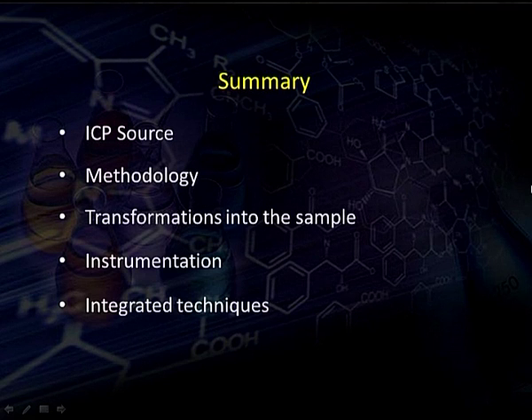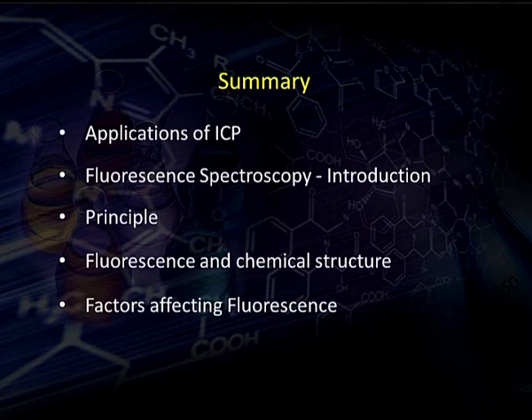Coming on to the summary. Today we have studied the remaining part of the inductively coupled plasma, which included the ICP source, methodology, transformations of the samples, instrumentation, the integrated techniques, application of ICP. So, these were all about the ICP.